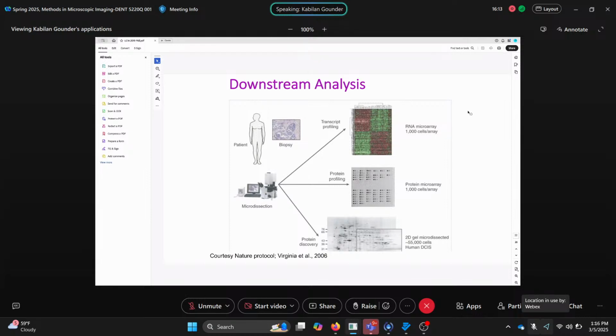As a physician or a dentist, if they suspect something in the tissues or organs, they will do a biopsy and test with bright field microscopy or fluorescence microscopy, and use this for diagnosis purposes.